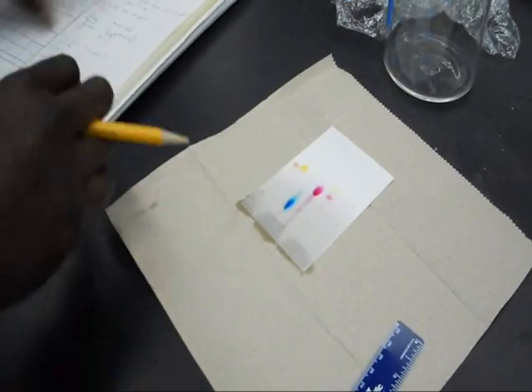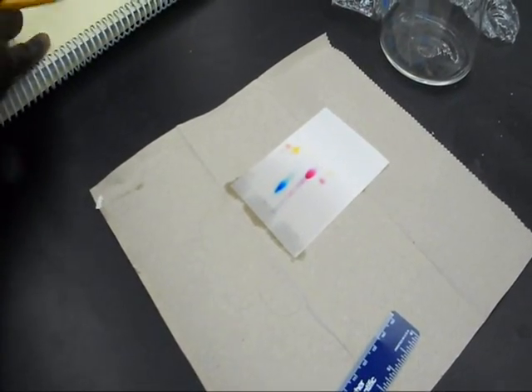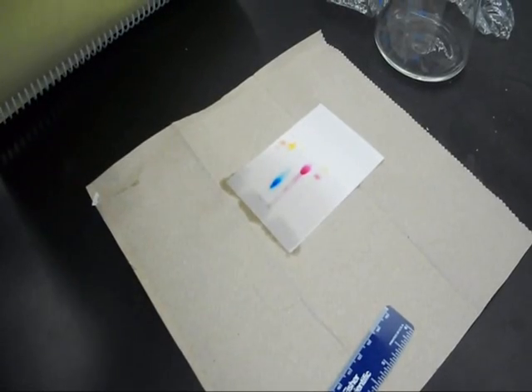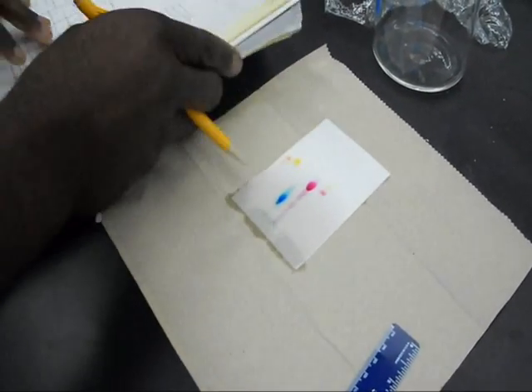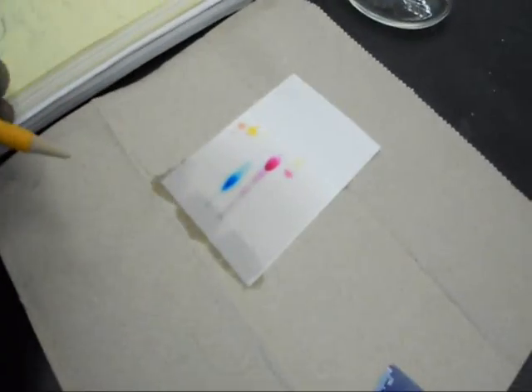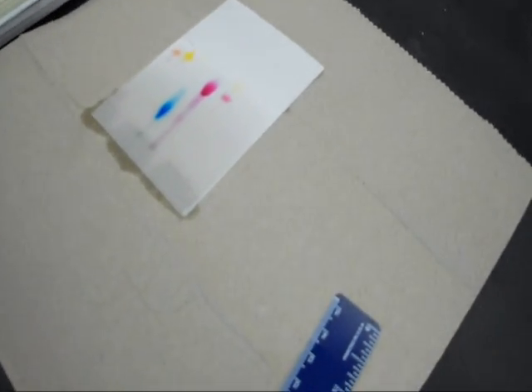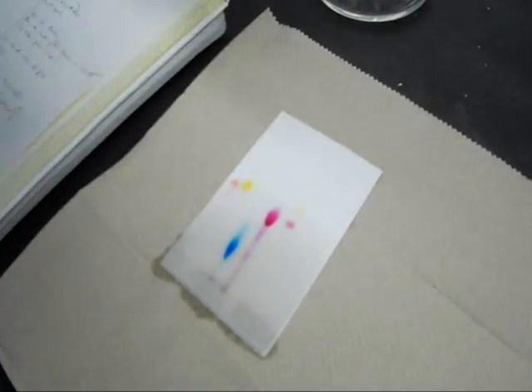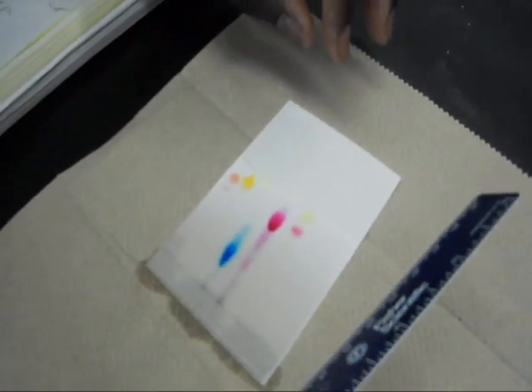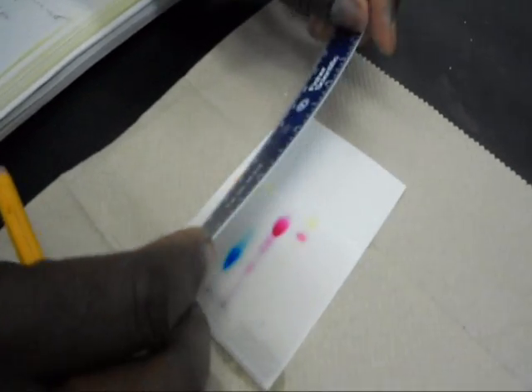Now we're going to take our solvent distance, these dots, our RF values and measure them. So the first one is going to be methyl red.